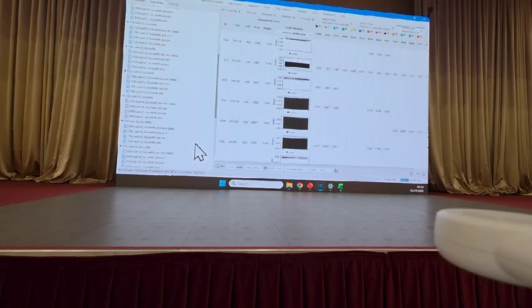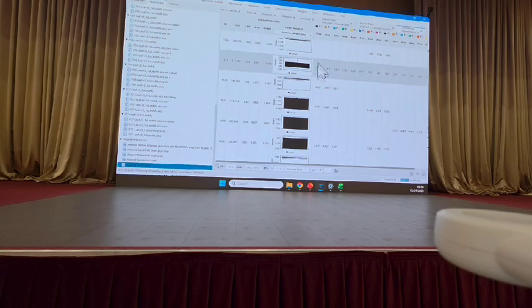This is not the final one because we did some other filtering, but what this is now, each row represents one metabolite in the sample, and that has a retention time. So how long did it take for the metabolite to reach the detector, the feature to reach the detector, the m/z, and then it has the intensity found in each sample.